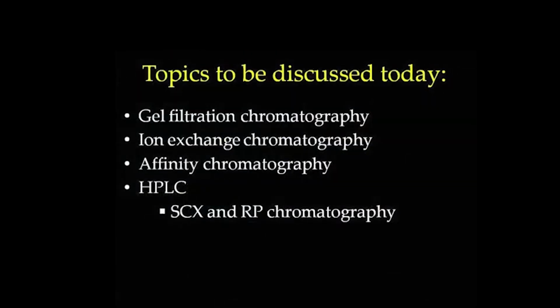So, the lecture outline will talk about gel filtration chromatography, ion exchange chromatography, affinity chromatography. These methods will be discussed in light of protein purification, and then we will talk about a few methods such as strong cation exchange and reverse phase chromatography for peptide isolation using high performance liquid chromatography methods.